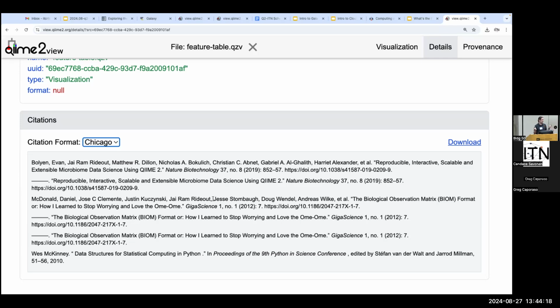When we write those plugins, we integrate information on the relevant citations in there so that if you generate this reproducibility supplement, you get a list to make sure, okay, I cited Chloe's Q2FMT paper in there because I was supposed to cite that one because I used it. It's important for your work. It's probably most important to our plugin developers who want to get credit for their work. And so we try and make that really easy to help motivate people to build for the system.